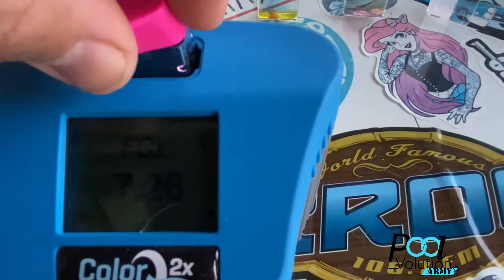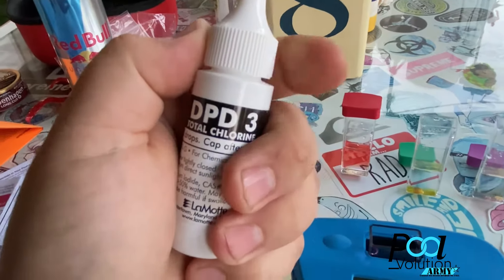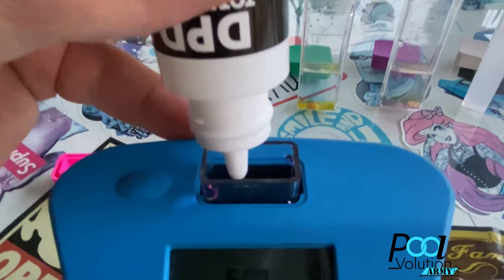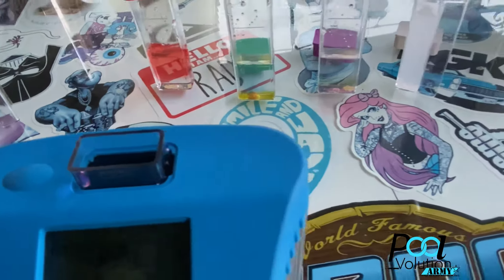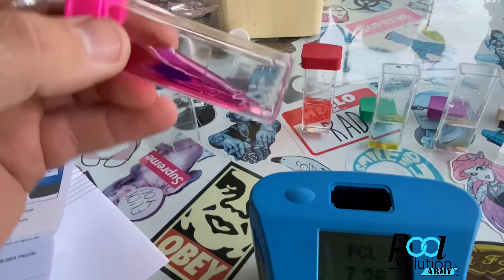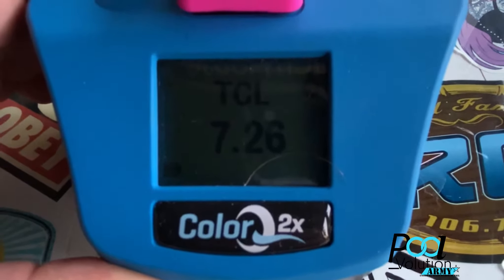After you get your free chlorine results, you can do total chlorine or skip it. For total chlorine, get the reagent called DPD3 and add five drops. Everything is five drops in this kit, which is pretty cool — the only time you use anything other than five drops is for the tablets. Add the five drops of DPD3, invert three times, hit the button once and it will say 'TCL,' hit it again and it gives your total chlorine reading. As you can see, I have no combined chlorine.